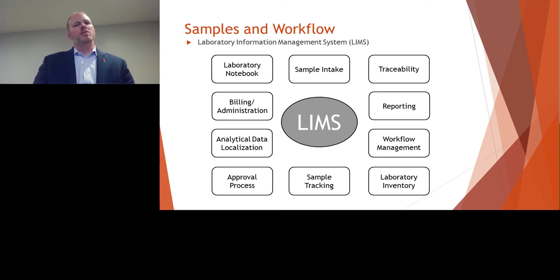Once that verification is done, you should be able to trust that data flowing into your LIMS directly from your instrument doesn't have to be peer checked on a constant basis. So there are different components and different systems that you, as a laboratory manager or director, should look at, so you can get something you're comfortable with and that can meet the needs of your particular lab.